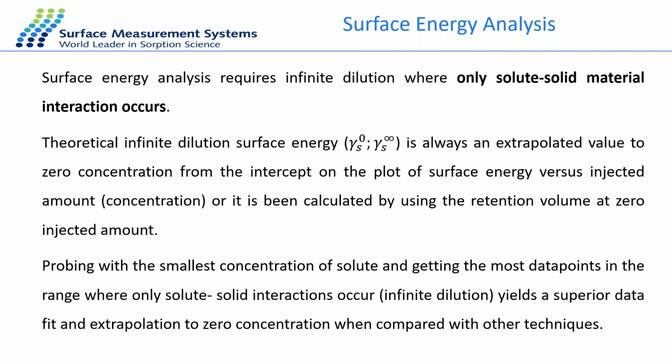The theoretical infinite dilution surface energy, the gamma zero or gamma infinite, is always an extrapolated value to zero concentration from the intercept on the plot of surface energy versus injected amount.